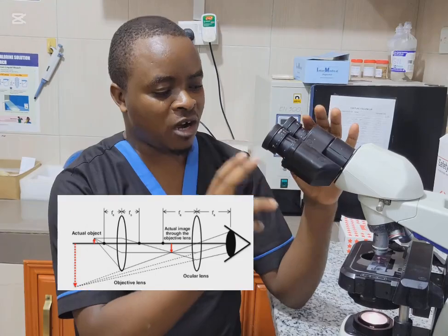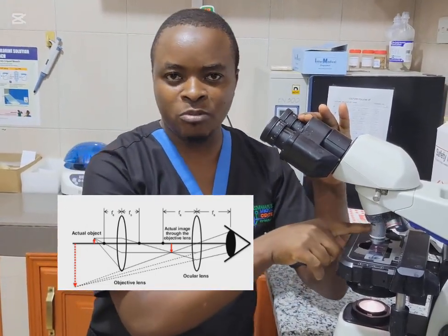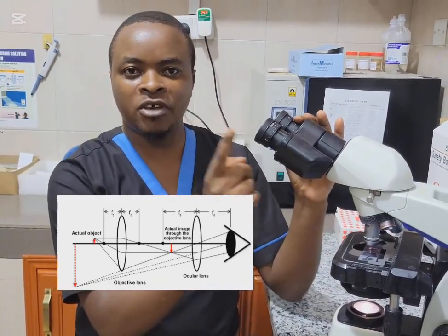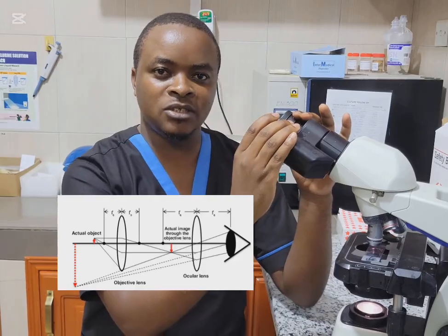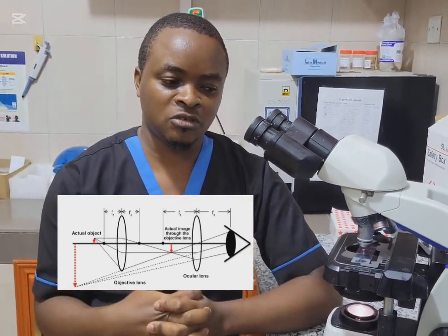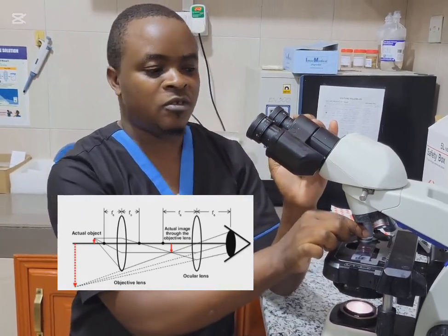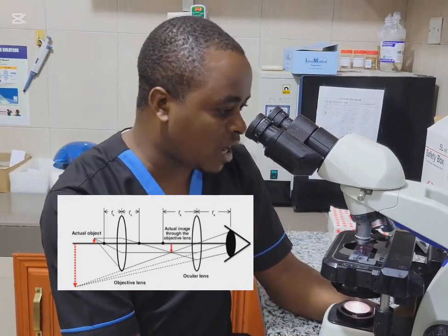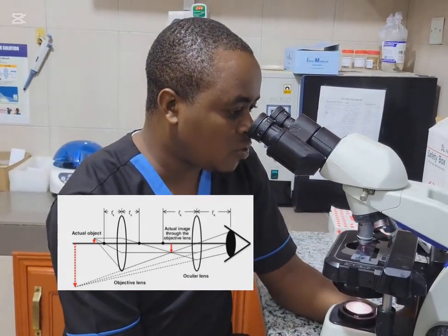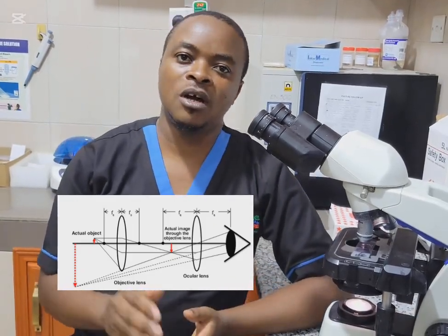So meaning we shall have the total magnification, which is the magnification of the objective times the magnification of the eyepiece lens to get what we call total magnification. So when the secondary enlarged image, which is larger than the primary in the objective, is viewed by the observer through the eyepiece while examining. So this is what we can talk about the principle about the light microscope.